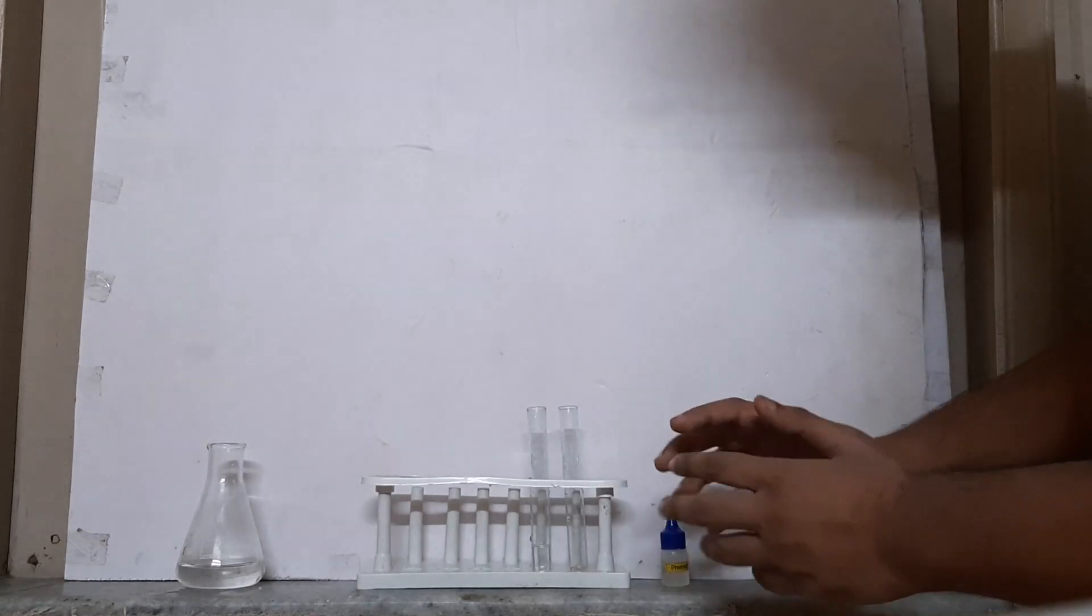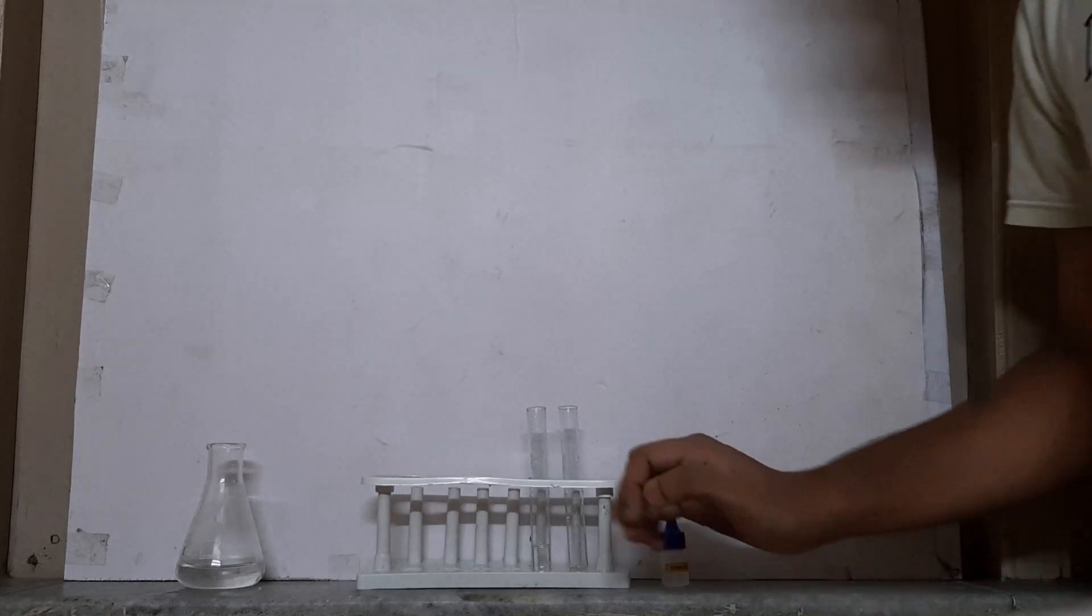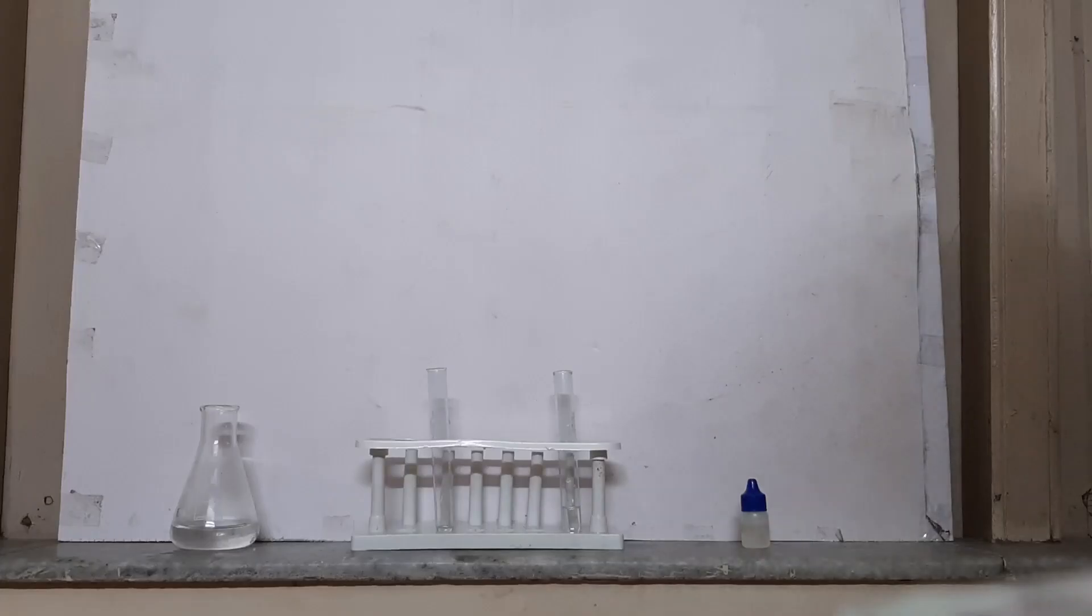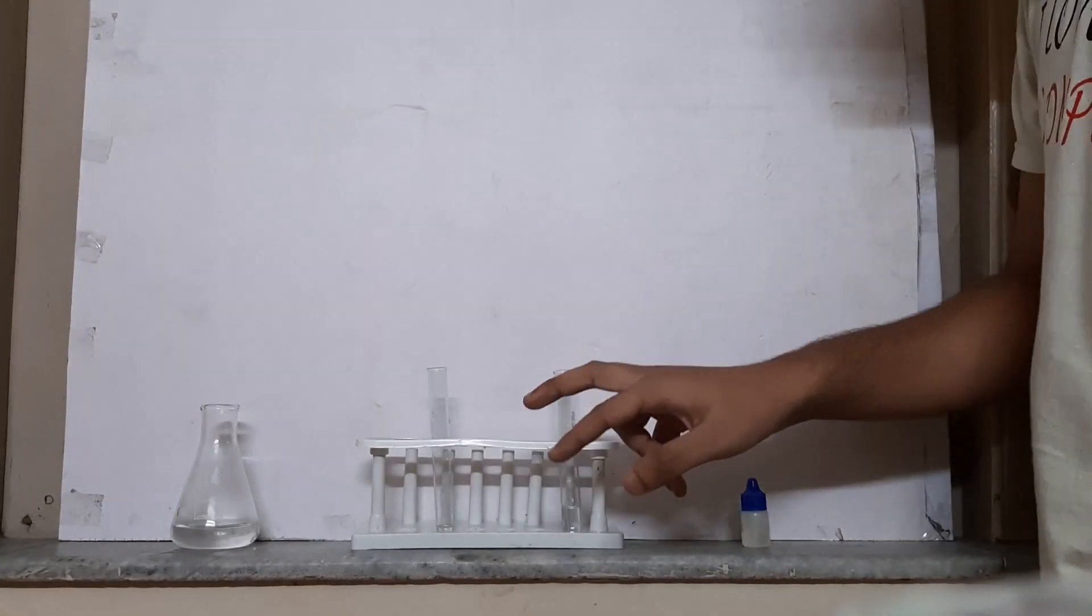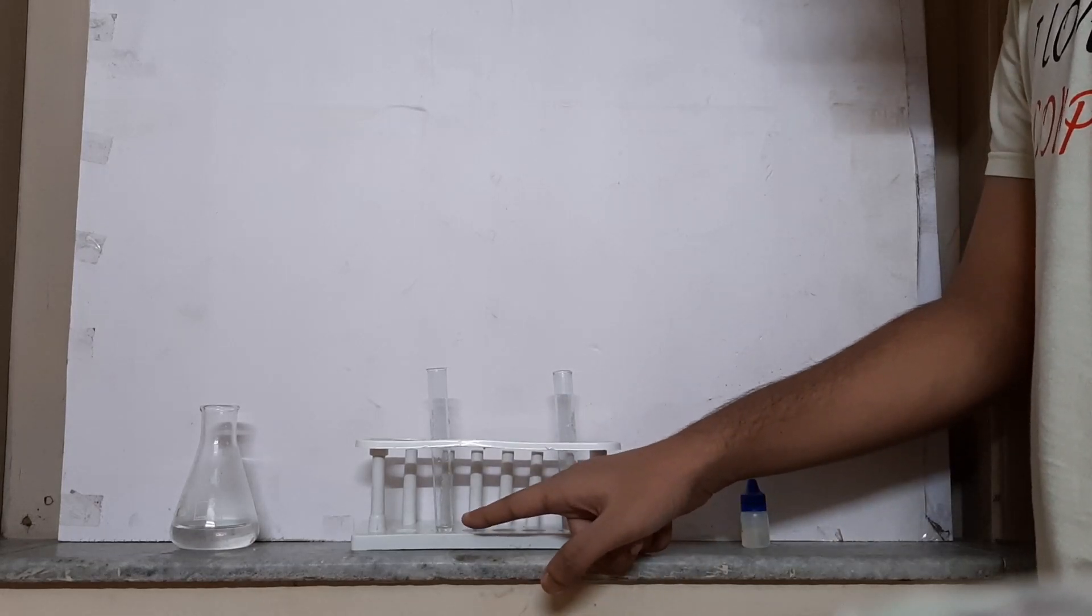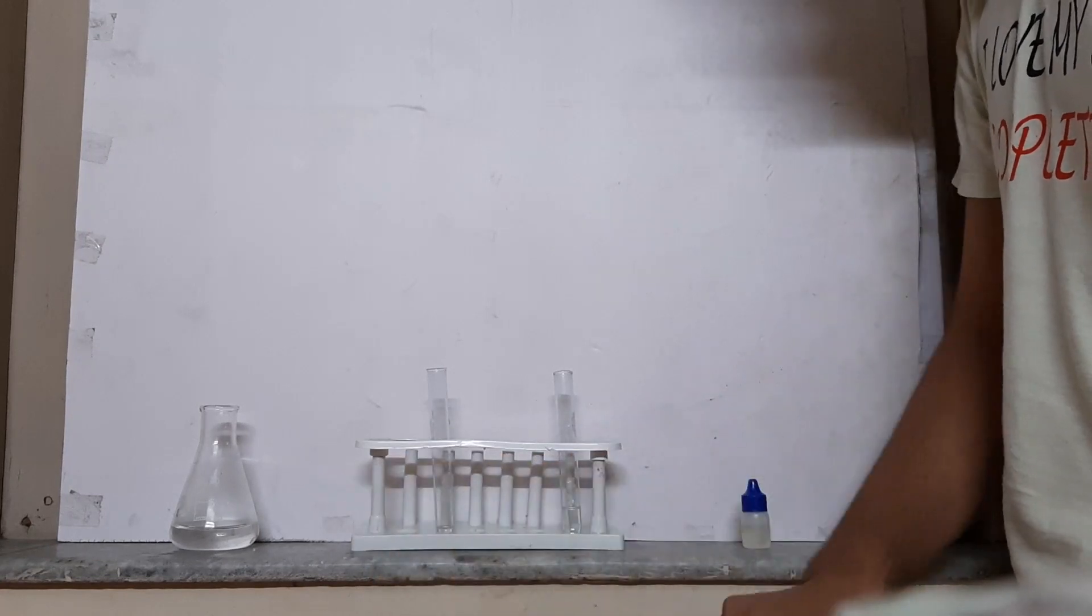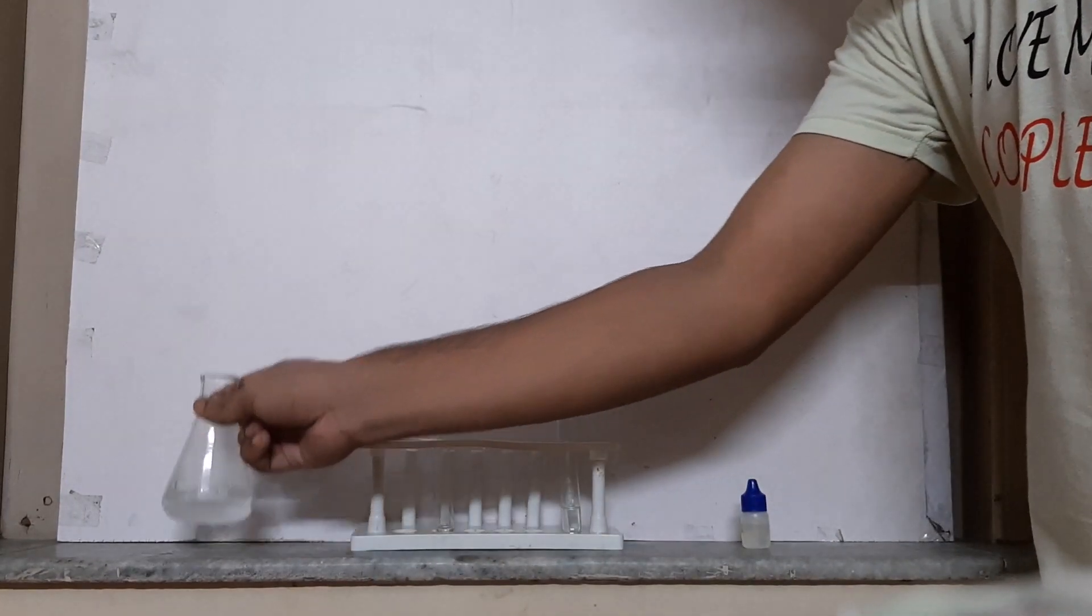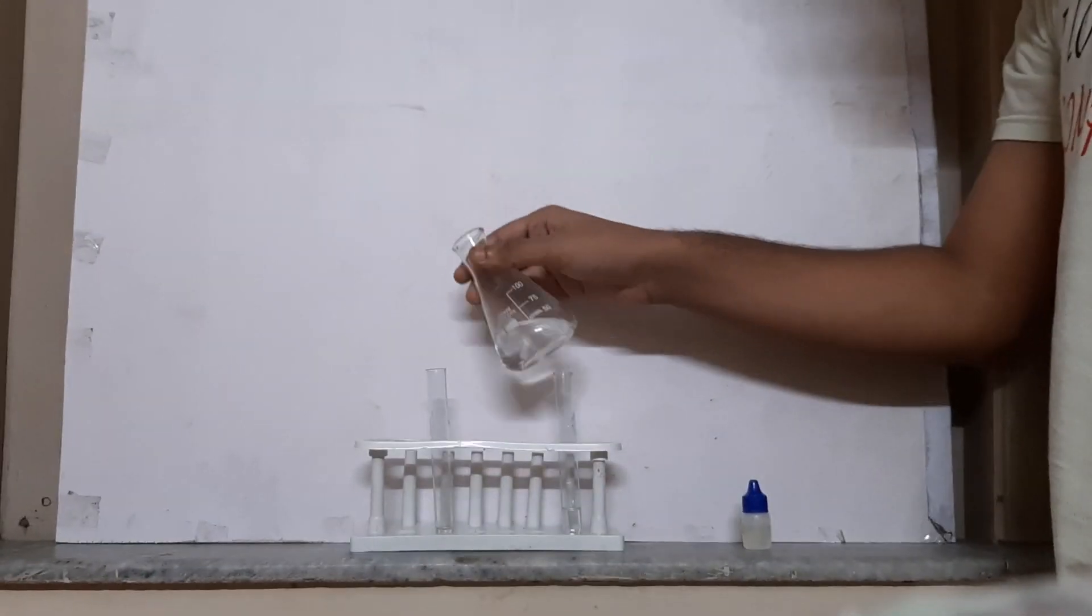Now let's wash the test tubes and return for the second part of the experiment. Now I have dropped some phenolphthalein here in this test tube. I'm going to add the concentrated NaOH solution and we'll see if there is a color change.